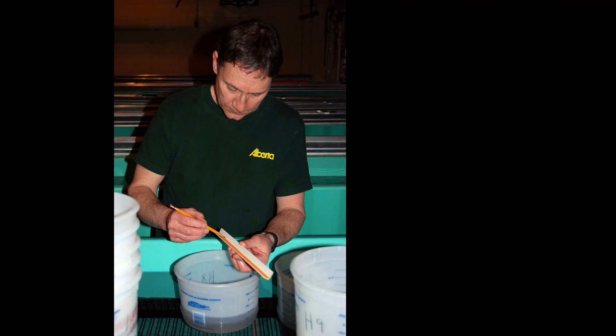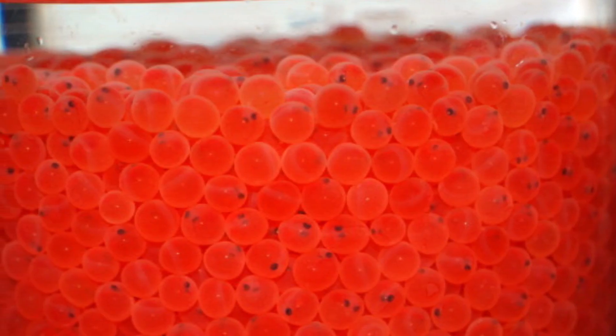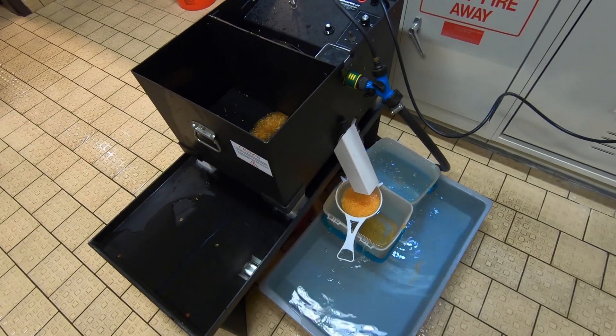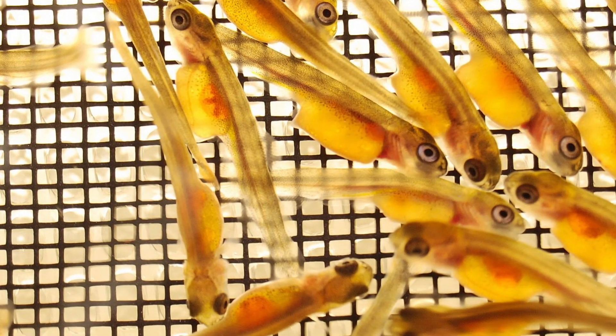After 2 to 3 hours, the eggs are disinfected, inventoried, and placed in an incubator. Most eggs are incubated until the eyed stage, about 22 to 32 days at 10 degrees depending on species. At that time, they are cleaned up and shipped to the provincial hatcheries for hatching, rearing, and stocking into public waters.